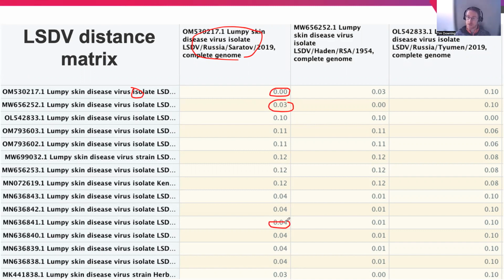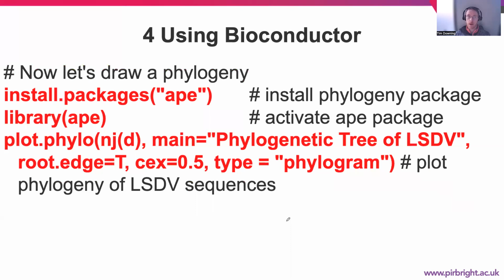Another tool we can add on to this, looking at our distance matrix, is to take our original sequence alignment, and we can draw a phylogeny. So we can use this package called ape, which can do evolutionary analysis. We can activate our library here and use this special function called plot.phylo. The function plot will also work, but it's calling the one inside the ape package here. So to avoid ambiguity, you're better off using plot.phylo because it's more intuitive for yourself. If you're rereading this code in a year's time, it creates less confusion.